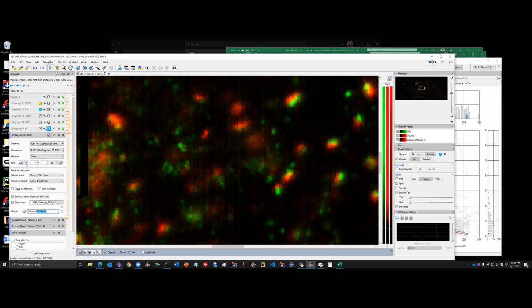How I can do this is using the filter operator, where we have, of course, more standard operators, such as taking the particles which are closer or shorter than a certain distance, or taking a range, or accepting the particles that are outside of a certain range, positioned elsewhere outside of the distance between A and B. And now I run this.